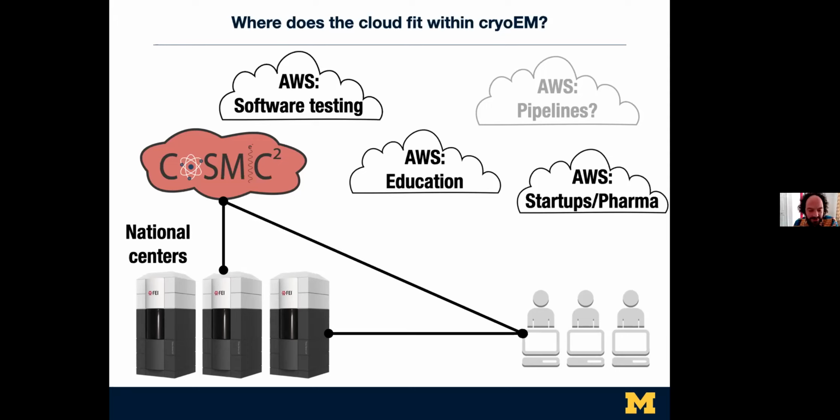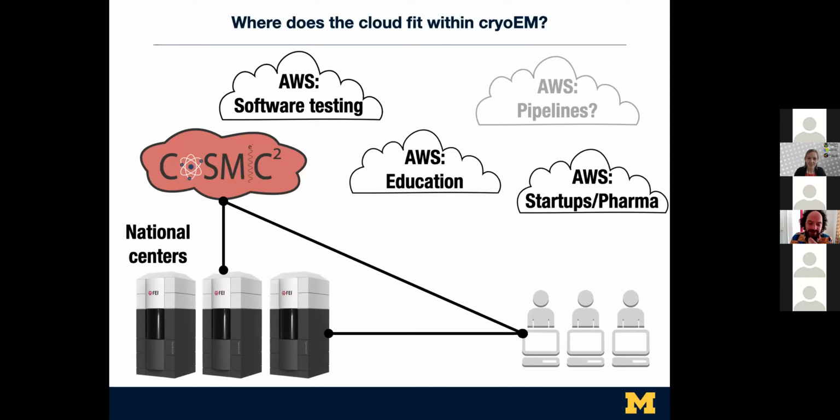Sure. As I said in the beginning, if you turn on these machines 24/7, it's more expensive than probably buying it yourself. So it seems like if you are a national center, it probably makes more sense to buy machines. It all depends on the costs and where the money goes. It seems like local is better, but I think it is a scalability bit. The cloud is also nice for scale because you could scale it out more. It might be a stumbling block to only have 1 machine running Warp, and maybe you need 5 or something at a time. So I don't know. That's my answer.